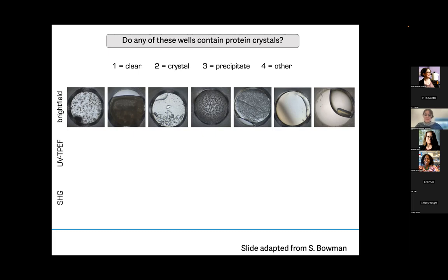We're kind of between protein crystal and precipitate for the first one. All right, I'll go ahead and start going through these as people get their answers in.